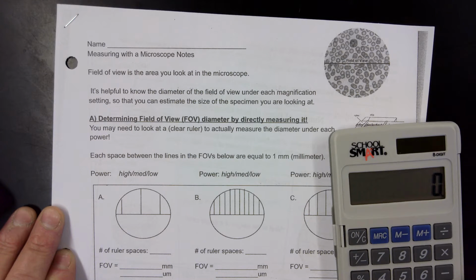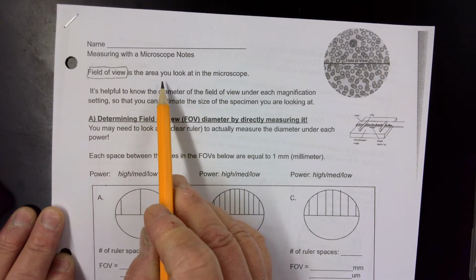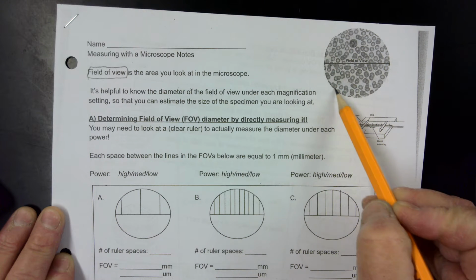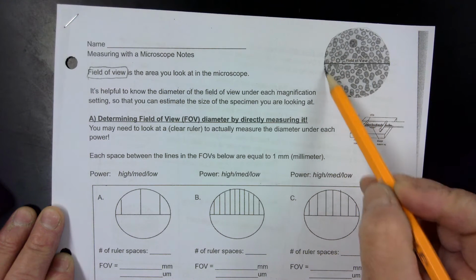Let's take a look. First thing first, let's identify that a field of view is the area that you look at in the microscope. When you look into the microscope, you see a circle of light, and that circle of light is your field of view.